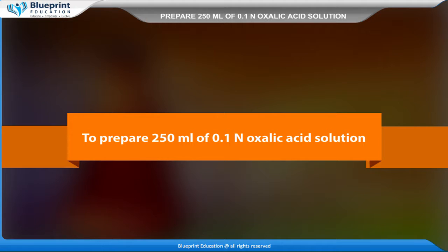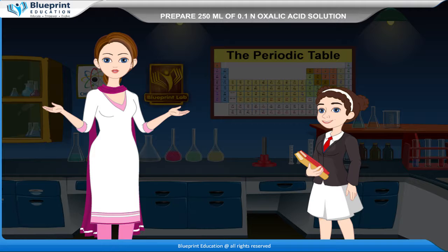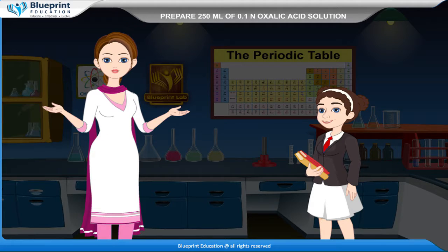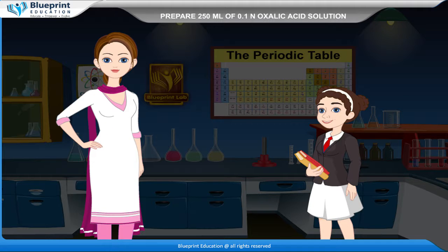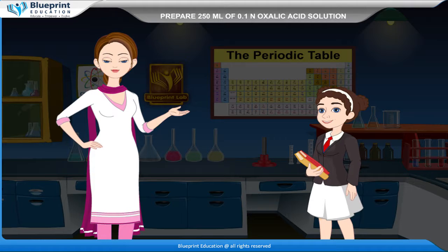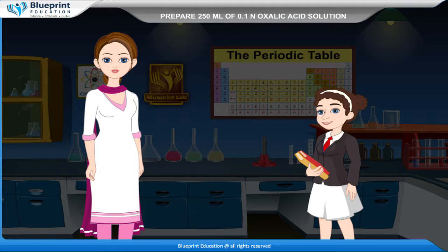To prepare 250 ml of 0.1 N oxalic acid solution. Oxalic acid is a dicarboxylic acid having molar mass 126 gram mol⁻¹. It is a primary standard and has the molecular formula COOHCOOH·2H₂O.